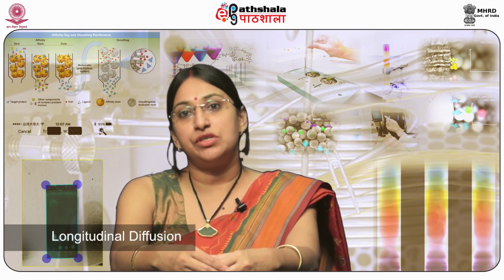A is the eddy diffusion that accounts for random movement of analyte molecules through the column. B is the longitudinal diffusion due to the concentration of analytes more into the center as compared to the walls of the column. C is the resistance to mass transfer due to the time taken by the analyte to equilibrate between the stationary and the mobile phase.